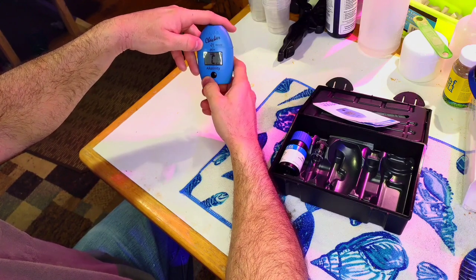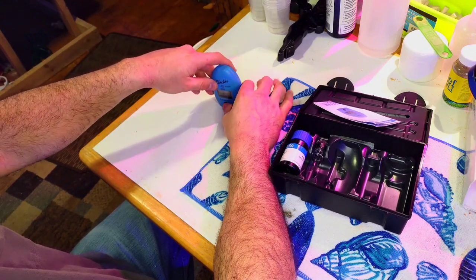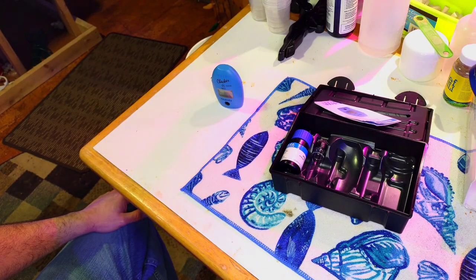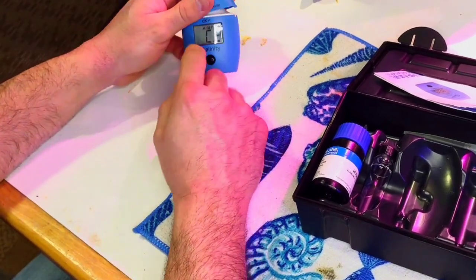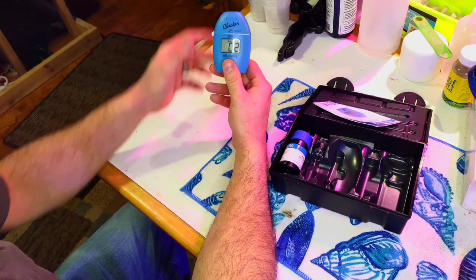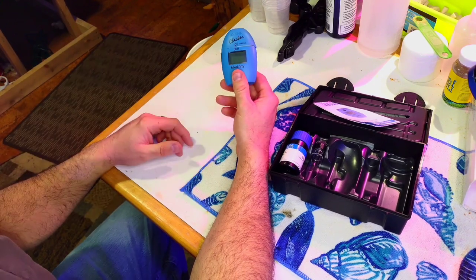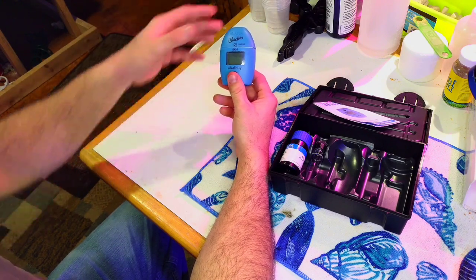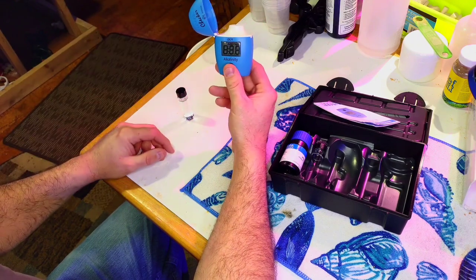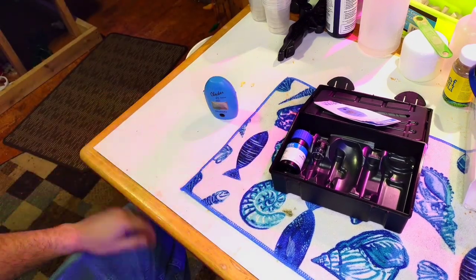This is the dKH tester, by the way — there is also a parts per million tester. With our water sample in, you hit the button and it will say C2. Sometimes the display keeps flashing — if that happens, just hold the button in to turn the tester off. It's sometimes quicker to turn it off and redo it. Holding the button brings you back to C1.